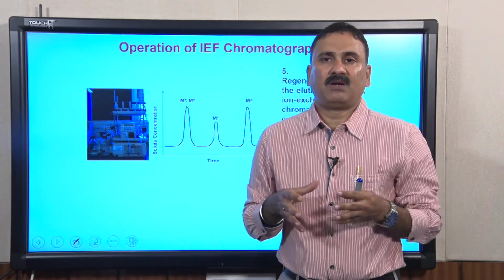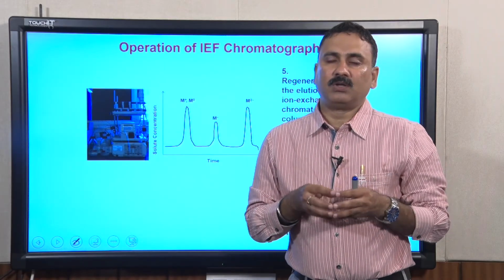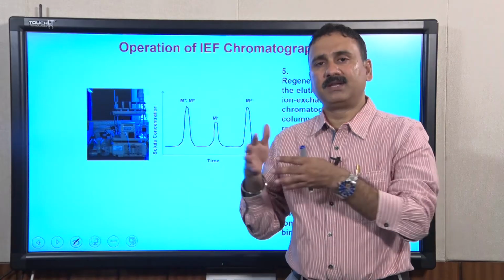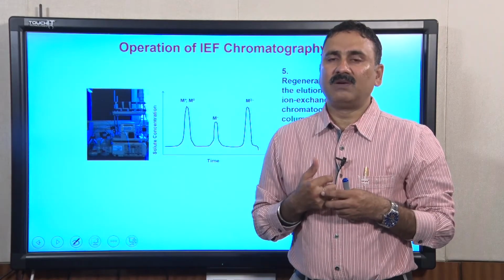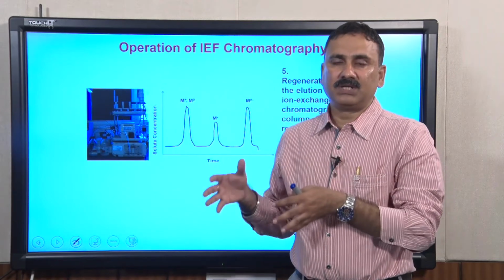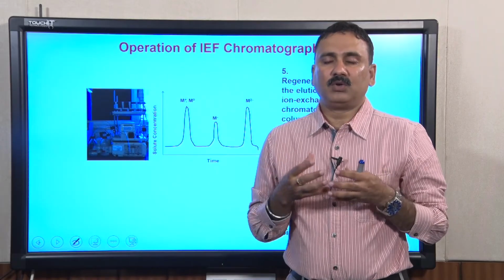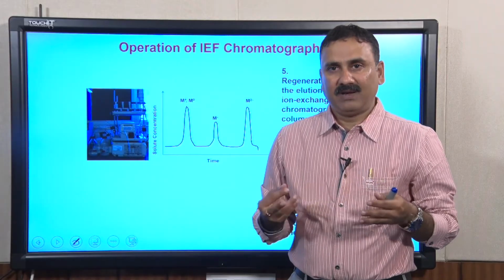So, ion exchange chromatography is used very extensively to purify positively or negatively charged proteins, and you have the flexibility of using cation exchange chromatography or anion exchange chromatography. Apart from protein purification, ion exchange chromatography is also used very extensively in other kinds of applications. Let us see in what way it can be exploited to answer a few basic questions related to science, as well as how it can be used in daily life.